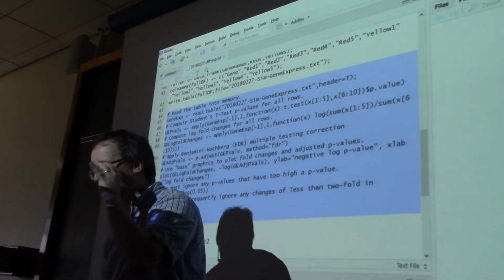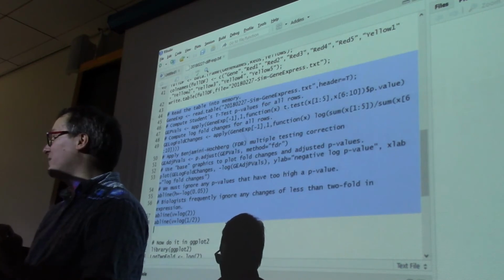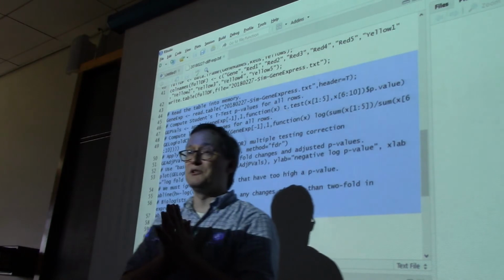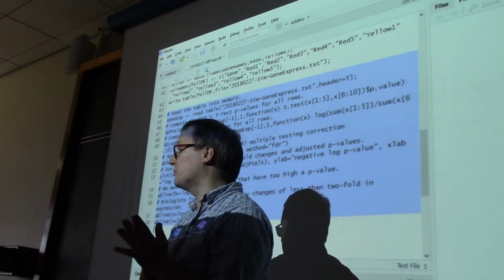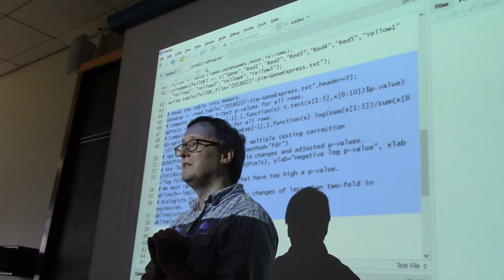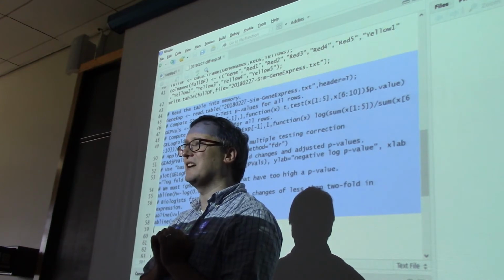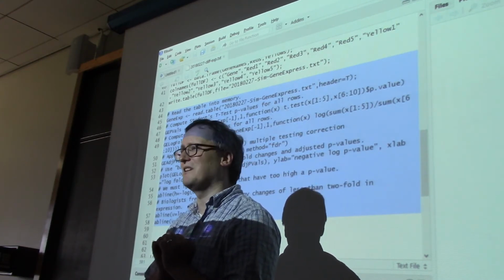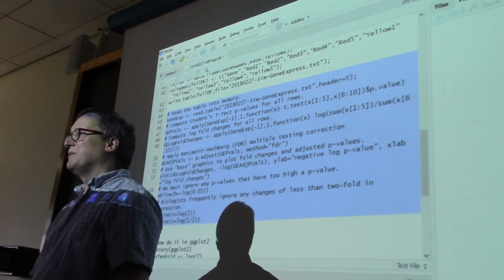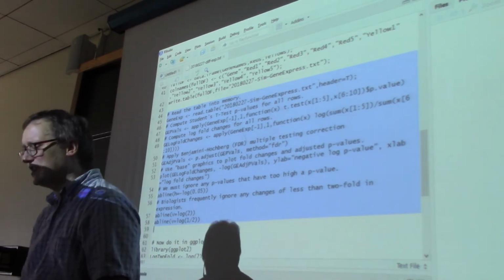All right, that's fine. So I want to repeat this, but this time I want to use ggplot2. Hopefully you are able to run install.packages just fine on your computer and get ggplot2 installed. Did that work for most people? No? Do you have network access? No network access. You do have network access and it didn't work. Oh, that's vexing. I'm not going to be able to correct all of that right now, I'm sorry, but that is one of the pains of using a package in a demonstration like this.